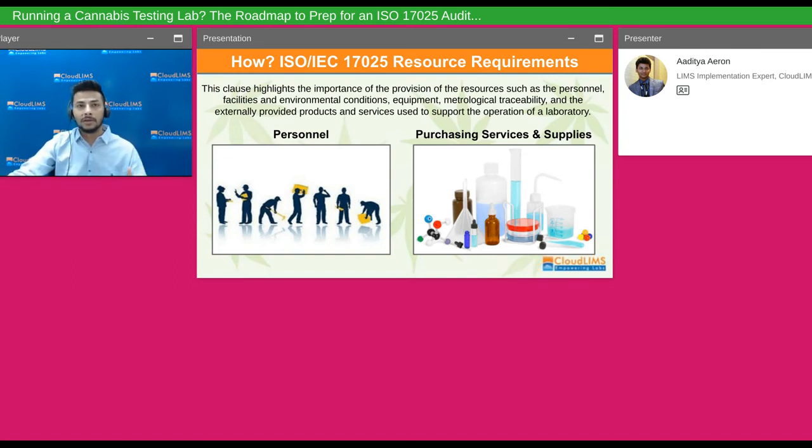Also, maybe Dr. Sam is competent to perform potency tests, whereas maybe Dr. Susie is competent enough to perform only the homogeneity test. So you need to make sure that your personnel is trained on the correct activity, and it's only them who work on the said task, so that you can assure the correct pattern is followed and correct test results are generated.